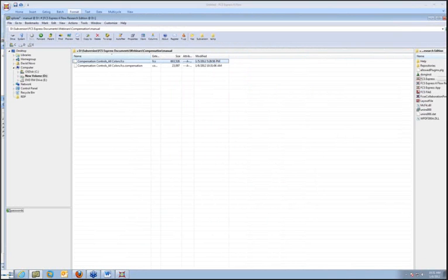Okay? What that means now is that in the future, if you ever load up this original file over here, if you just load it from FCS Express, FCS Express will automatically detect that there's a compensation file that you want to use with that particular data file. Okay? So that's a really easy way. We don't actually alter the original data. The original data stays the same way that it is, but we add this extra file to the folder, and from your point of view, it's all invisible. As soon as you load up this data file here, FCS Express will load up the compensation for you.